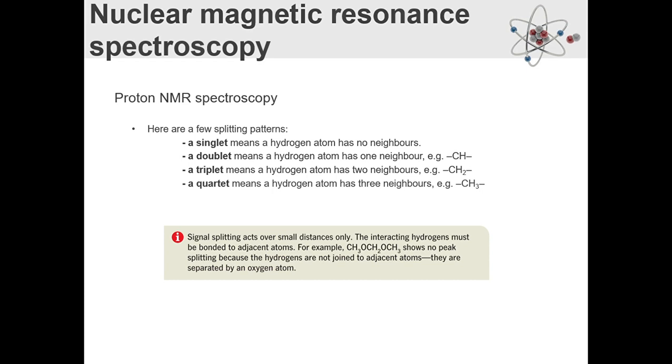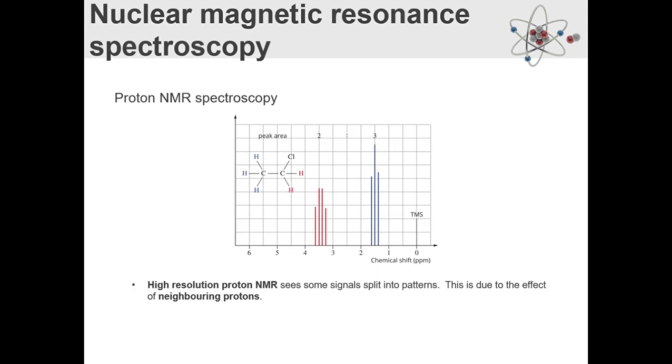Now, I'm going to go back a few slides. Actually, yeah, let's do this one. So we've got the hydrogen here. It goes one bond to the carbon, another bond to the next carbon, and one more bond to this hydrogen. It takes 3 steps or bonds to see the hydrogen. Because it takes only 3 steps, you know that those 2 hydrogens can see each other. They're neighbors.